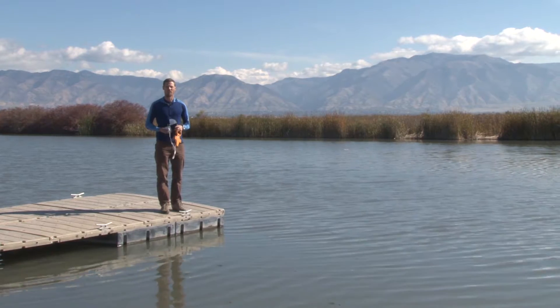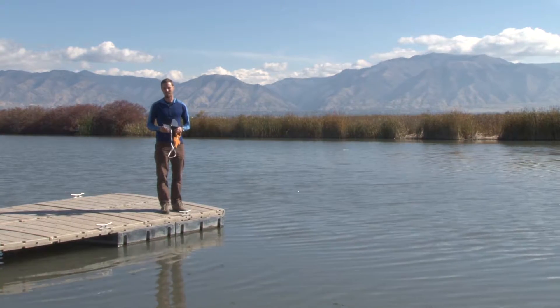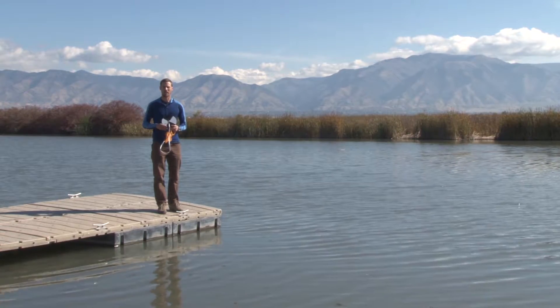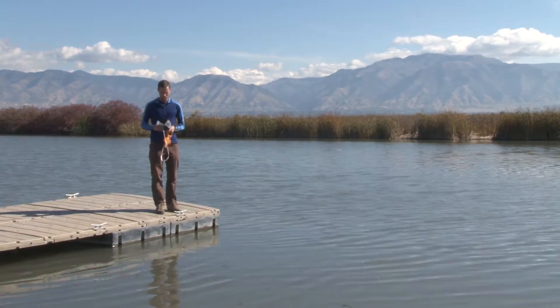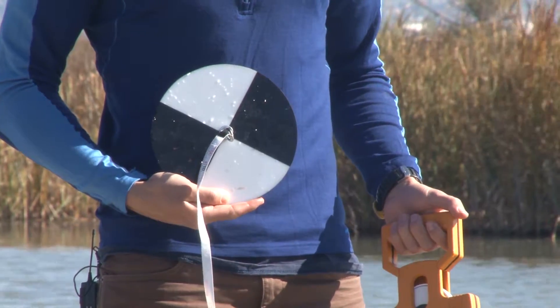We're going to go over the official method for how we do this in the state of Utah. Different states and different areas might have different methods. Some disks are all white, some have different shapes, but this is the one that we use here in Utah.